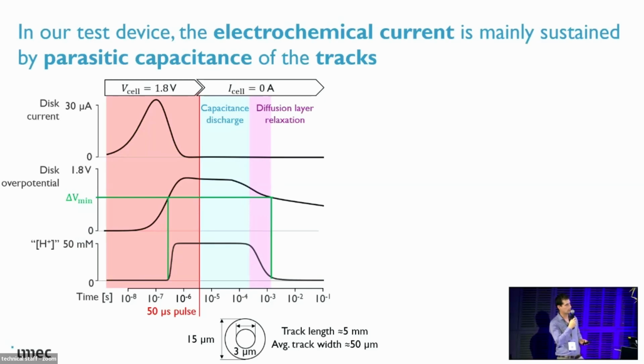And those build up quite quickly. As you can see here, after less than 1 microsecond we could in principle already switch off the cell. That would give us a factor 50 in terms of duty cycle that we can gain. But we couldn't go lower with the tooling that we have.